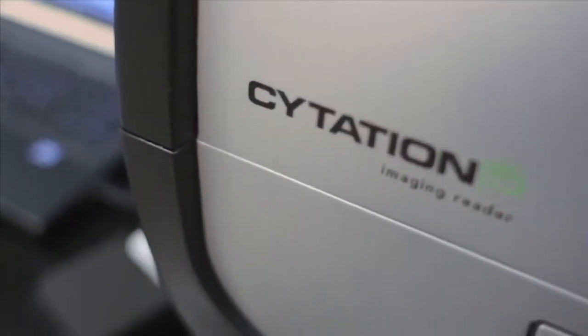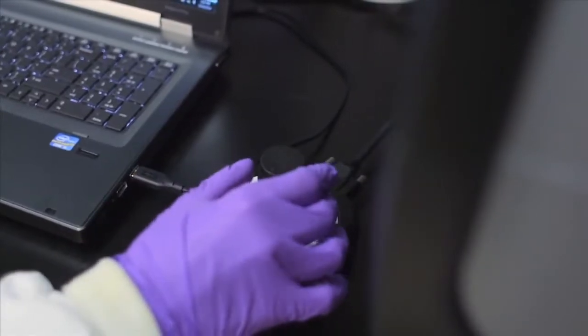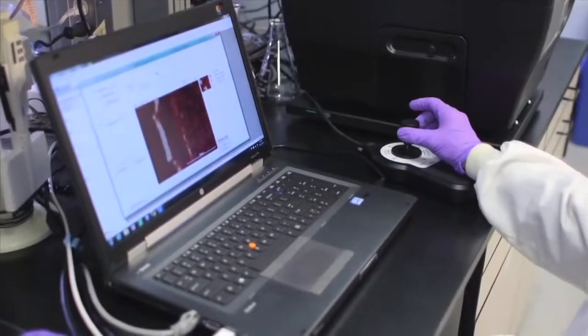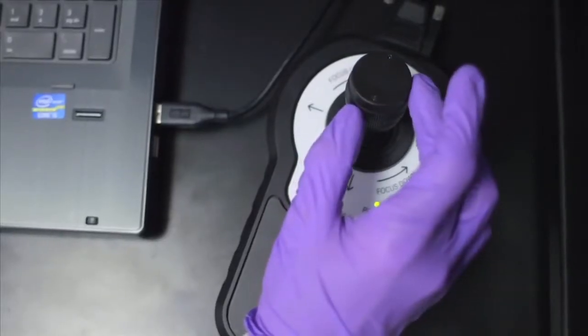An available joystick controller allows the researcher to move around the microscopy slide or microplate well in X, Y, and Z axes for precise positioning.